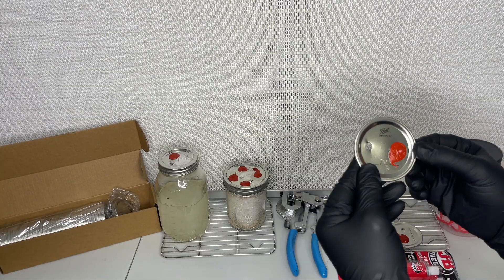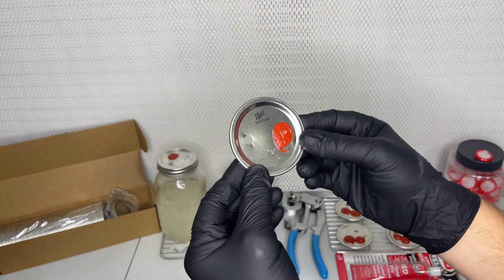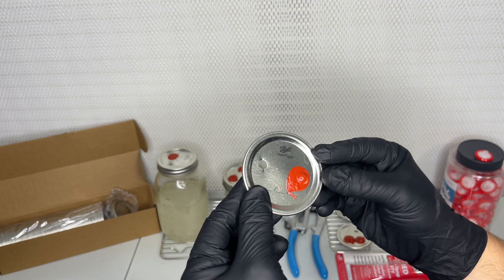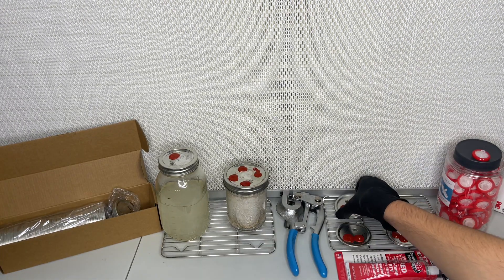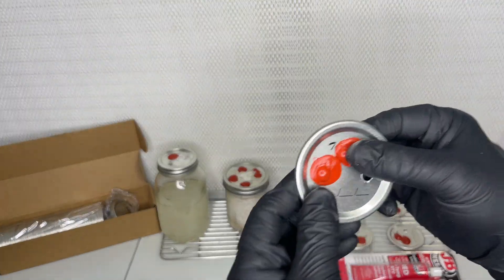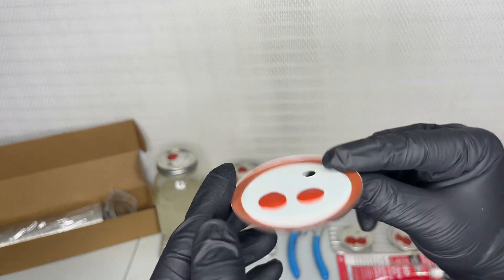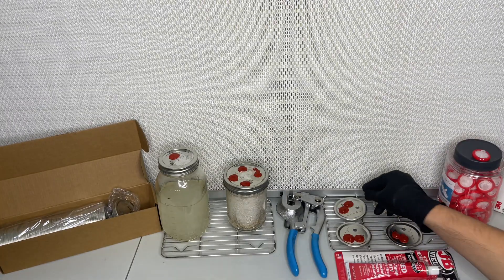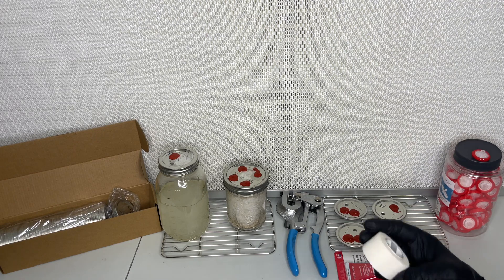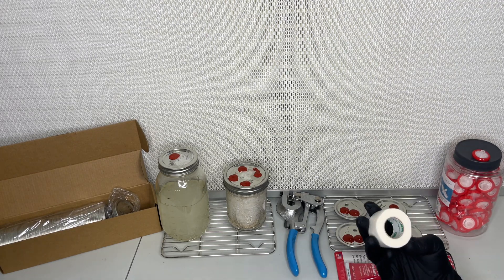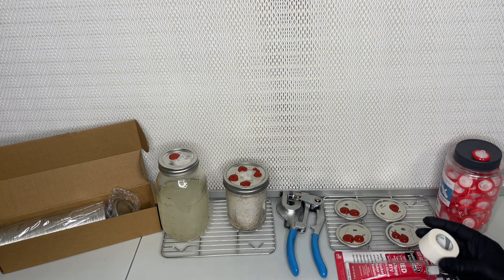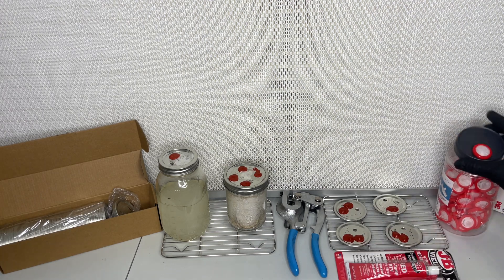Next I wanted to show you the modified lids that I make using RTV silicone. I've made thousands of lids using RTV silicone over the years, and honestly I'll never switch to anything else. I even started to use two injection ports on each lid so that I could get double the amount of inoculations, which from one port you usually get around five to ten before it starts to fall apart.